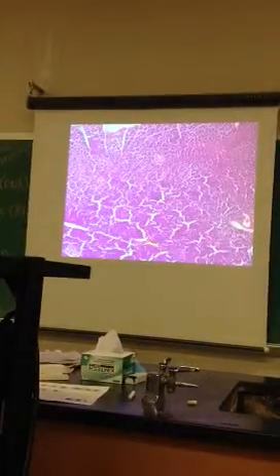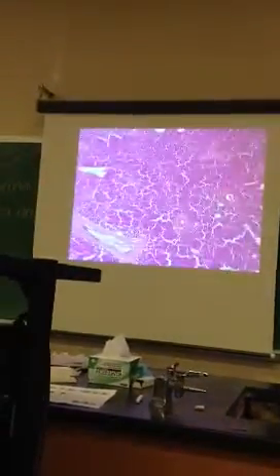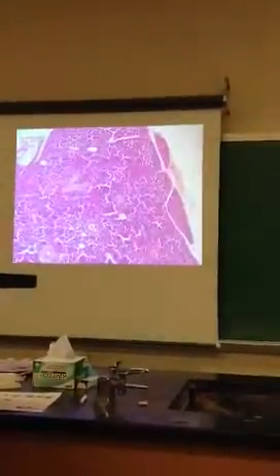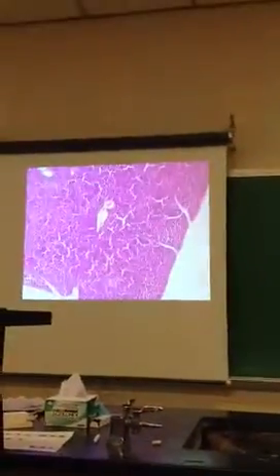Pancreas. I like the slide that was over there. That was a good slide. You can really tell the difference in the surrounding cells there, what they were.